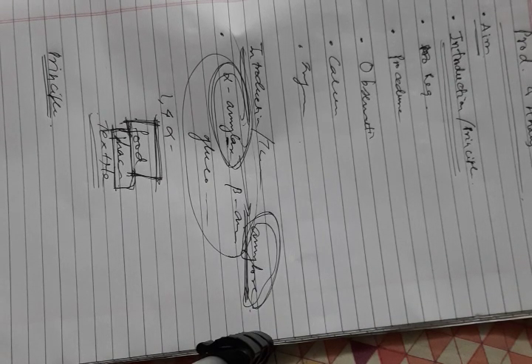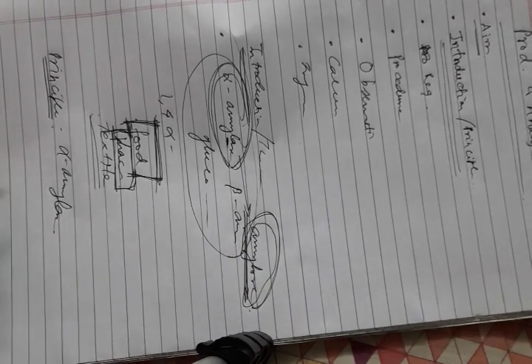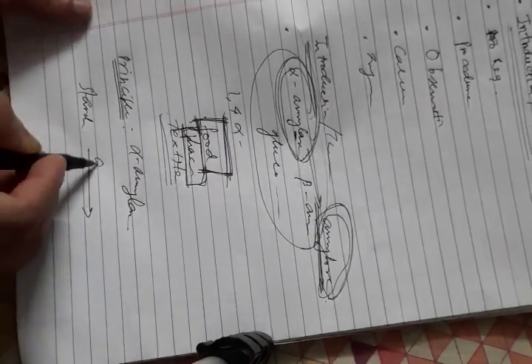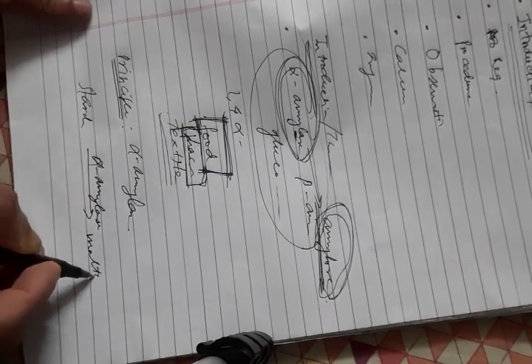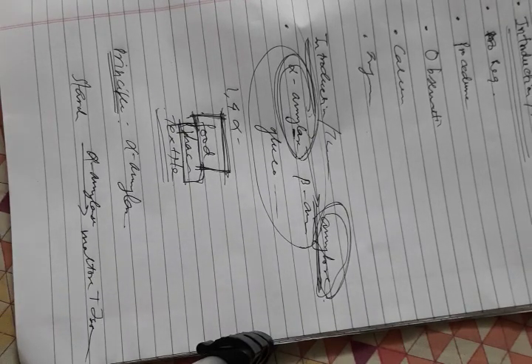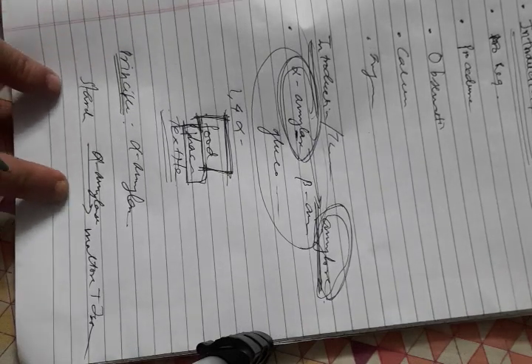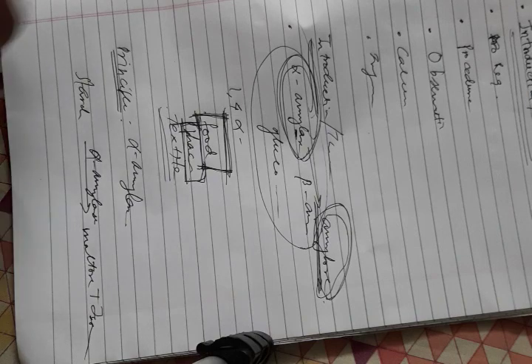Actually, what we are going to do here is find out alpha amylase. What alpha amylase does is, if we apply alpha amylase to starch, the starch breaks down into maltose plus isomaltose. Now, when we are isolating amylase, how can we find out how much amylase is being isolated, what concentration of amylase is being isolated?